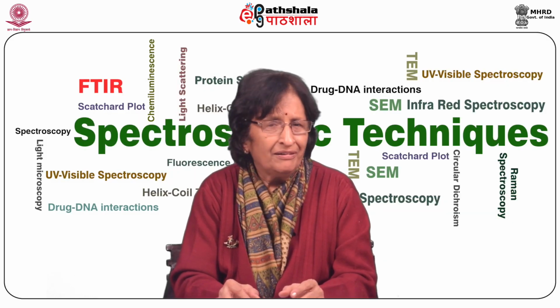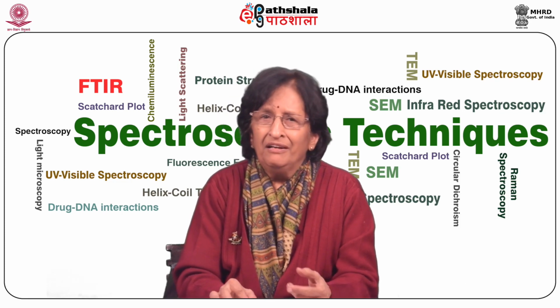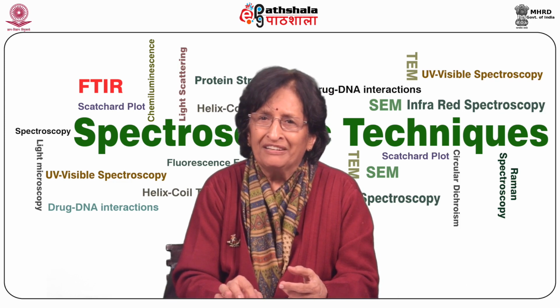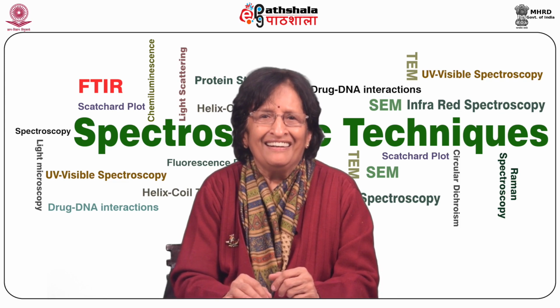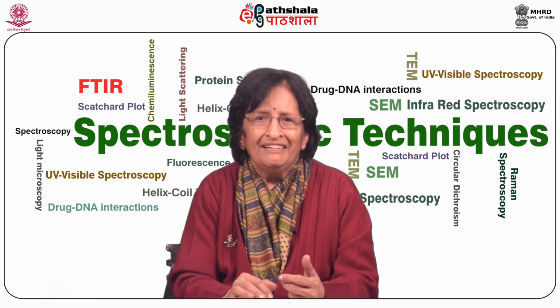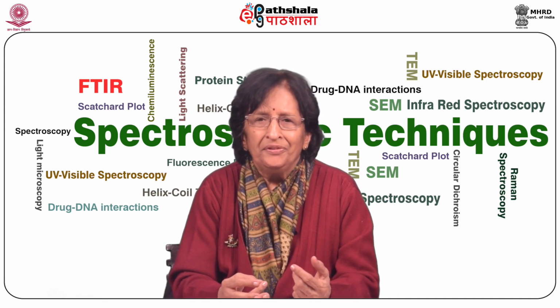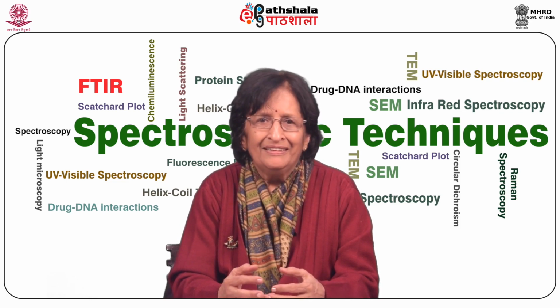Beer-Lambert law. The law for absorbance was originally discovered by Pierre Bouguer in 1729, and later on it was attributed to Johannes Heinrich Lambert.